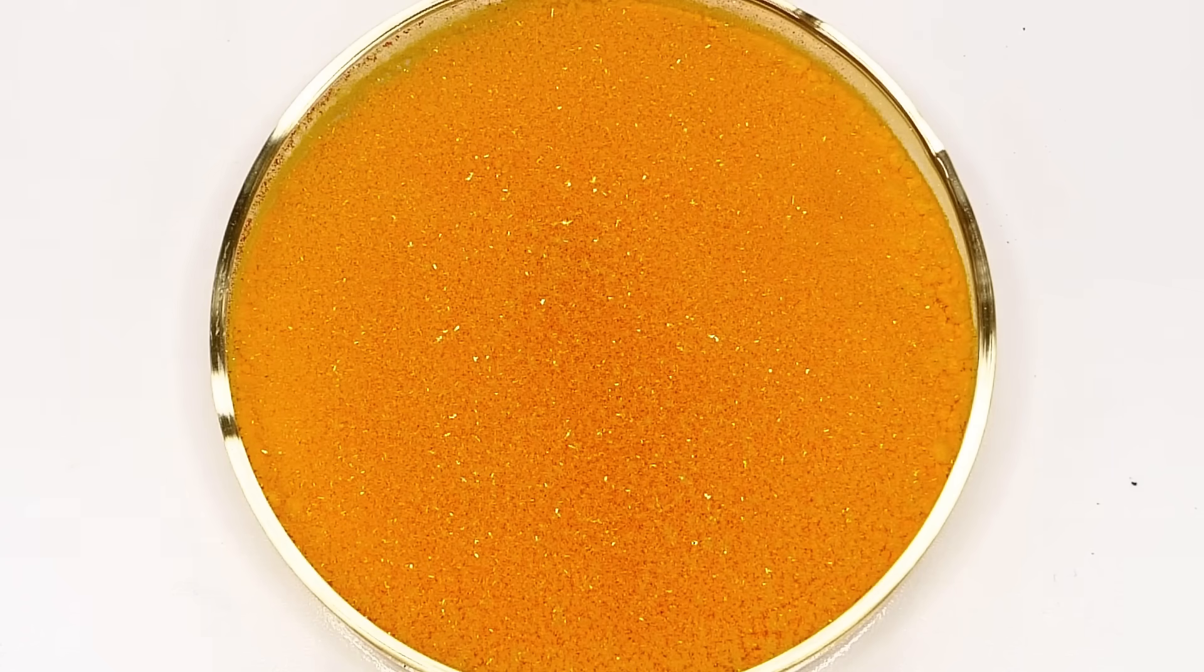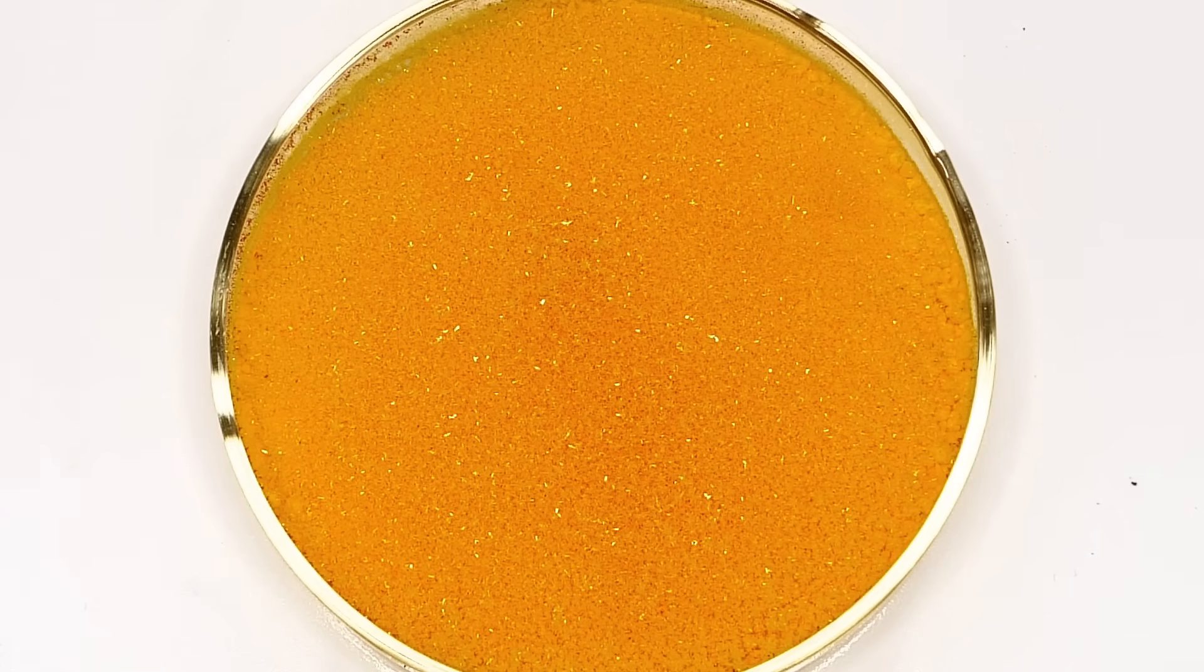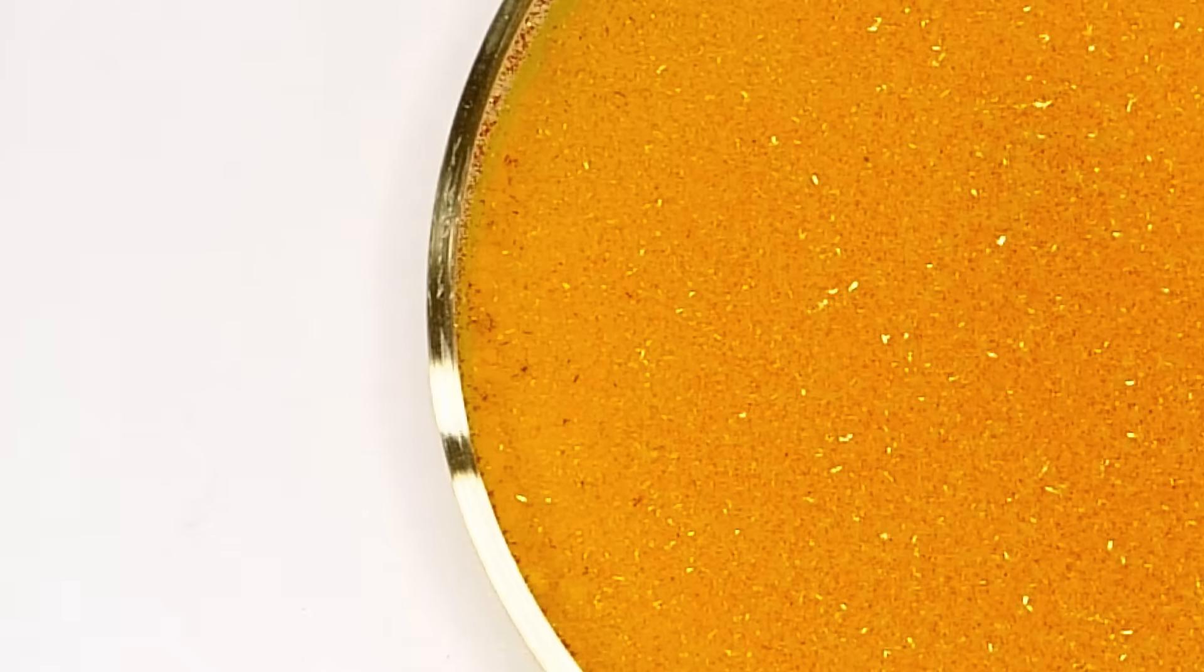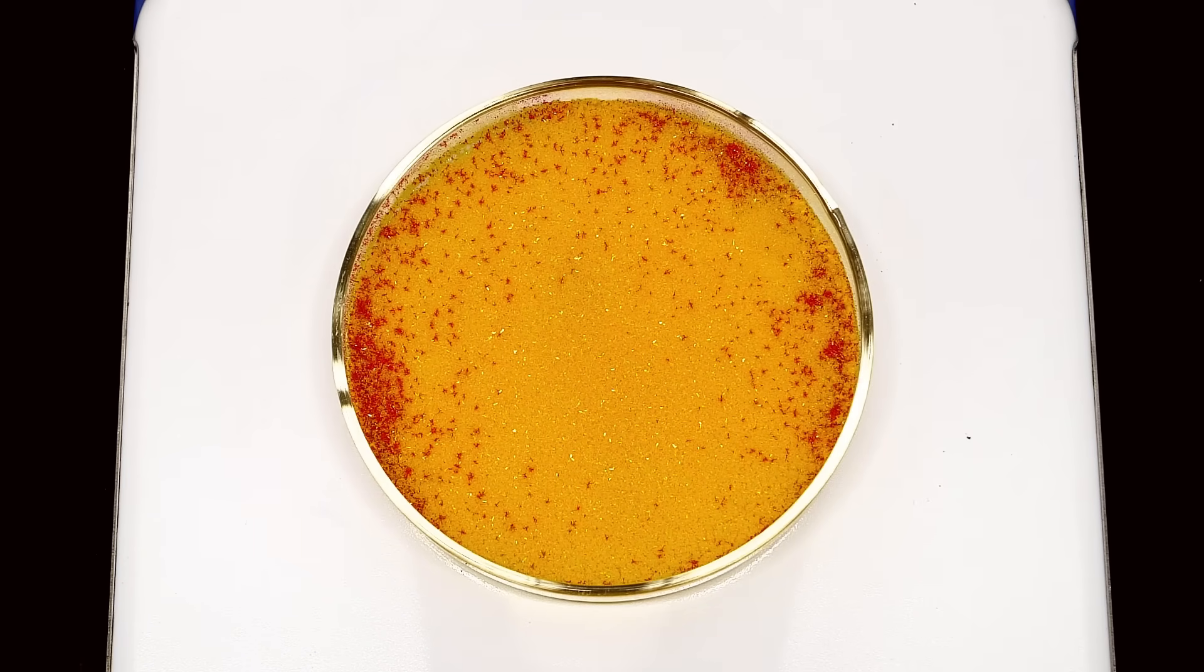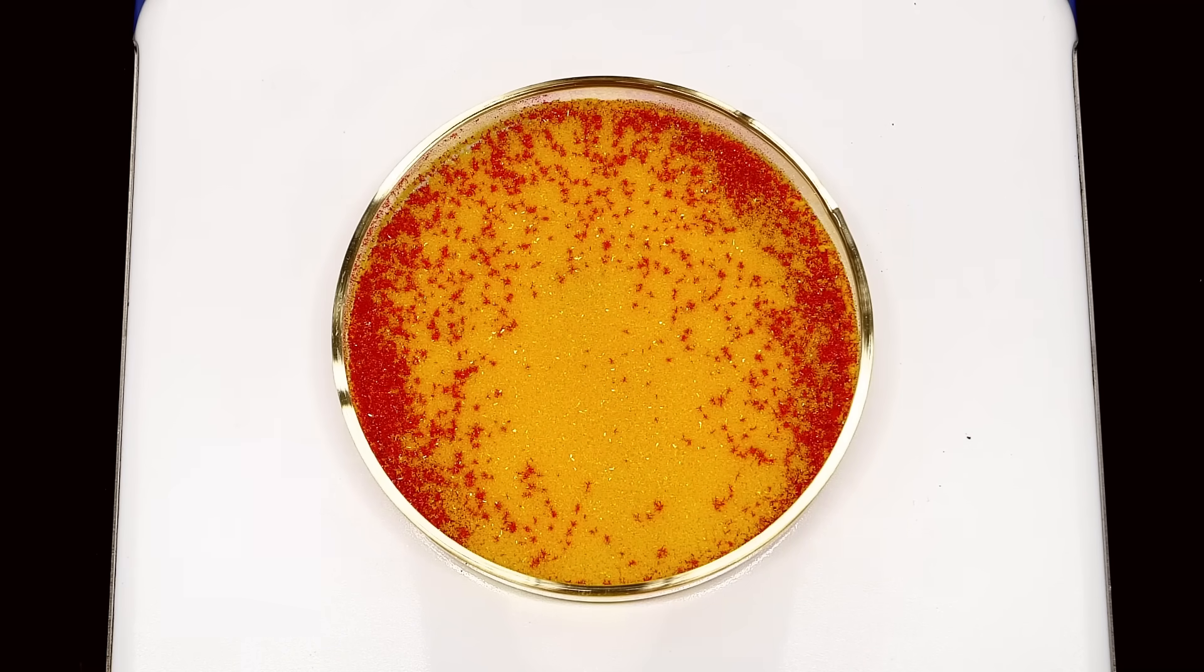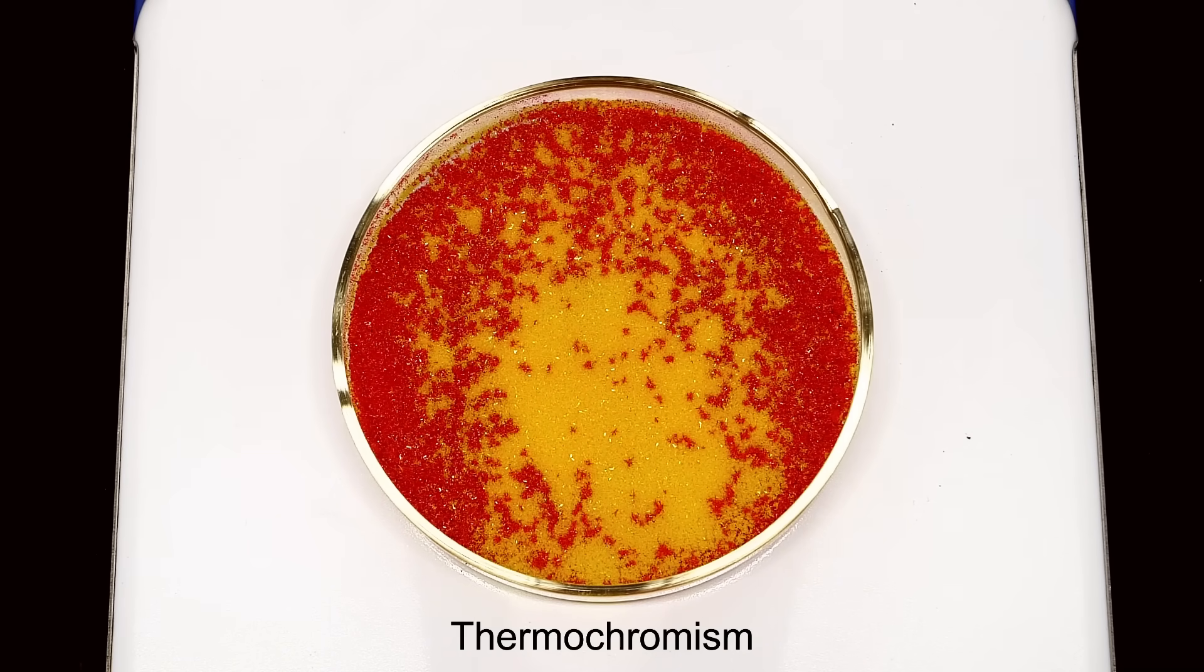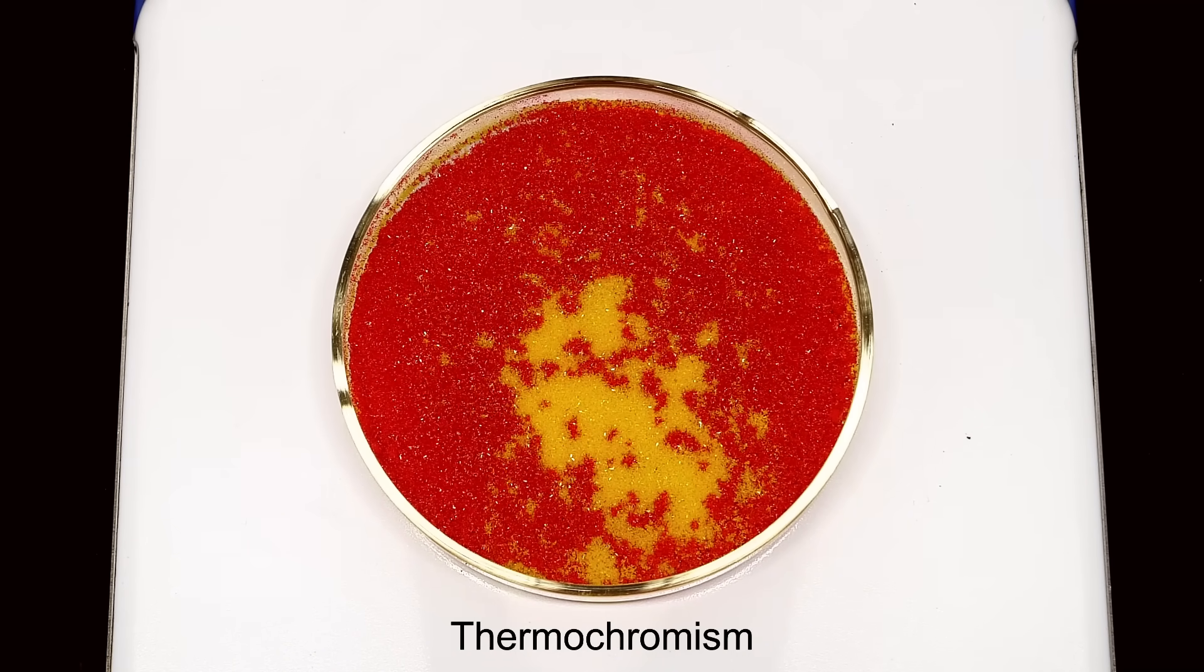What I think is cool, though, is what happens when I turn off the hot plate. Some of the red color starts coming back, and this is happening because the powder is cooling down. This color-changing effect, based on temperature, is called thermochromism, and I really think it almost looks like magic.